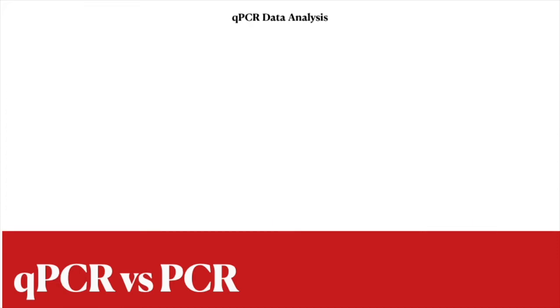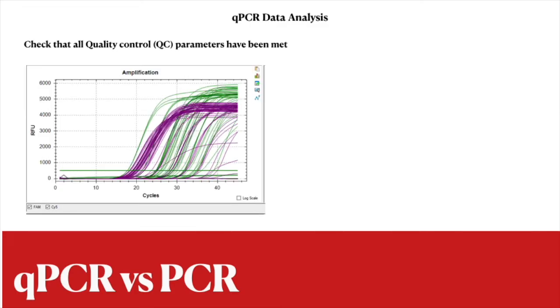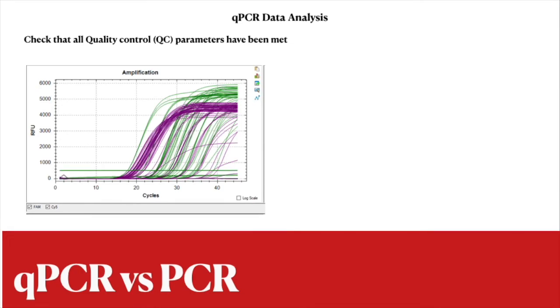And you must confirm that the quality controls are met before you can trust or communicate the results. It's important to take a look at the shape of the amplification curves to make sure that the amplifications are true amplifications and not just noise or interference.